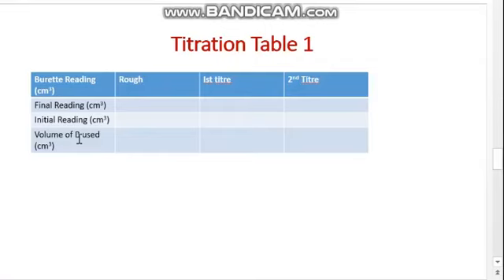If it's WAEC or NECO, they may say add solution E, add solution F, or put solution B, put solution F in the burette. That is depending on the question. This letter B might change. It might become A, depending on the solution you are putting inside the burette.